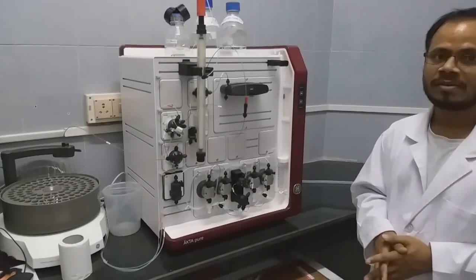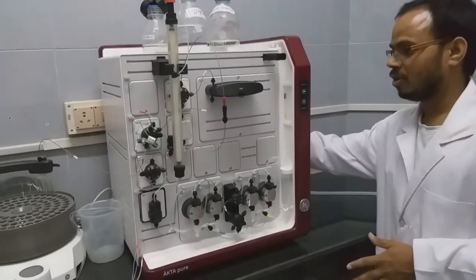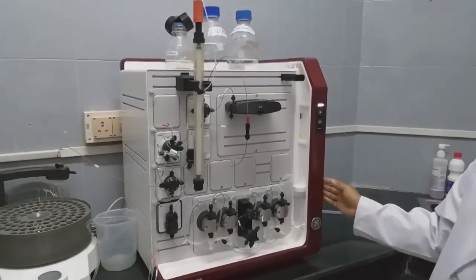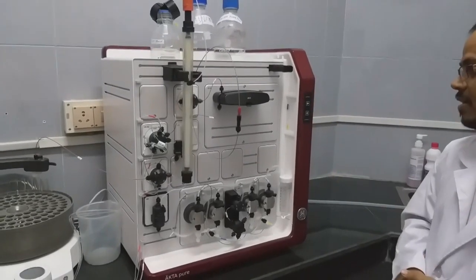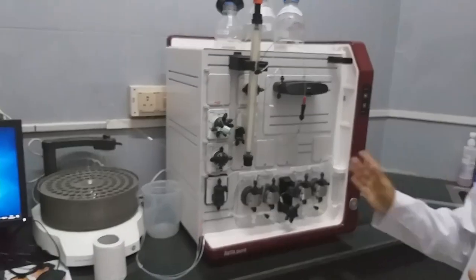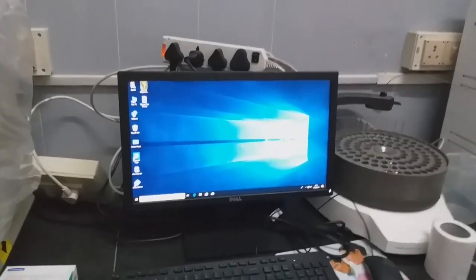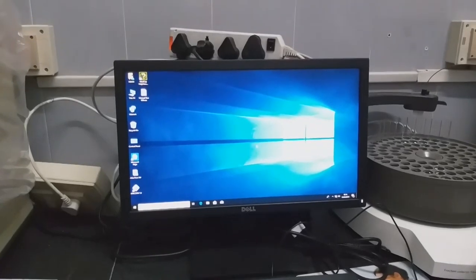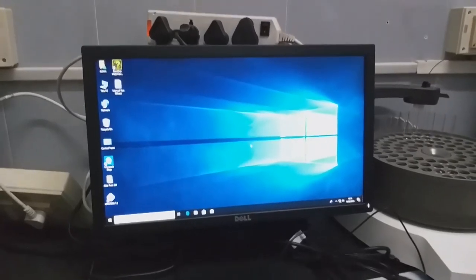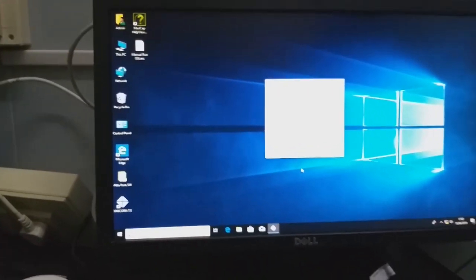To start the instrument, there is a power button on the right side. Once turned on, a white light blinks indicating the system has started. After that, we go to the software. For analysis of any elution, we use the Unicorn software that comes with the instrument. Just double-click to open it.